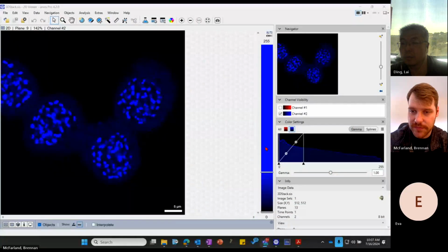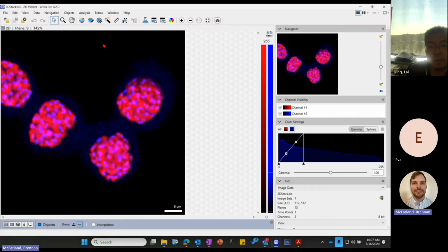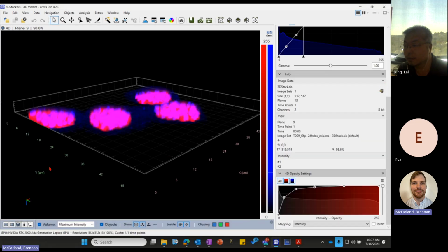So let me go ahead and share my screen. All right, so I have a demo data set here. I'm going to show it in 3D here.